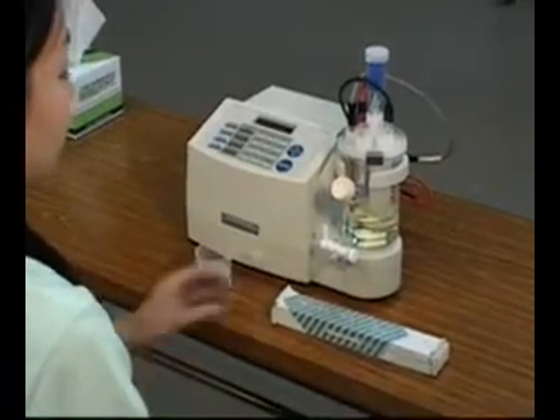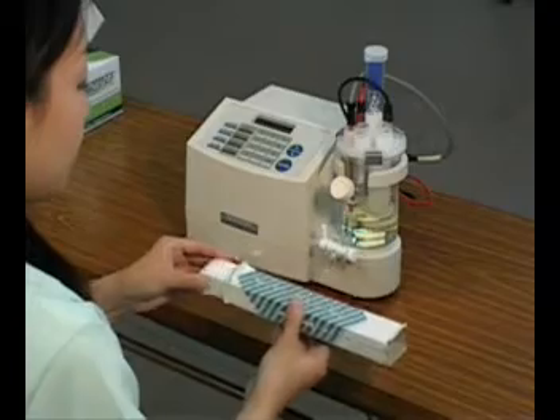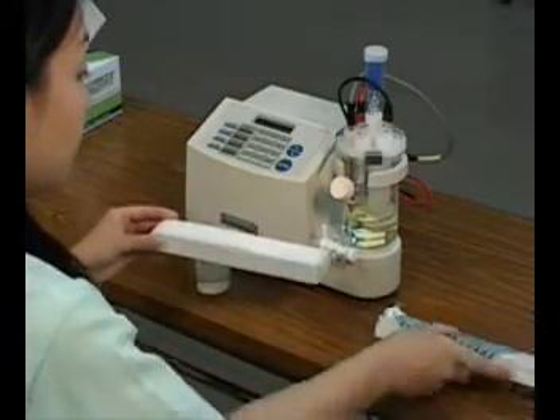To perform this test, please prepare the supplied microsyringe and a cup of deionized water.